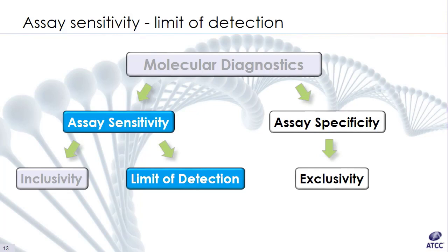A standard curve may also need to be generated for some assay types, like qPCR, and there may also be tests to establish ratios of genome copies with a secondary calibrator, like plaque or colony-forming units, or tissue culture infectious dose. Whatever the scope of work, accurate quantitation is very important because LOD results are reported to regulatory bodies and to customers. Practically, you want to achieve a limit that's as low as possible because a low limit of detection gives your end users confidence in the assay.